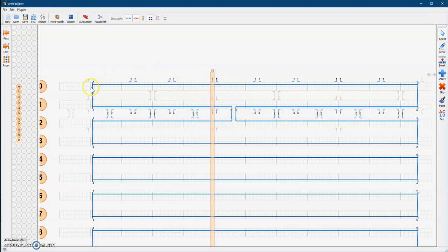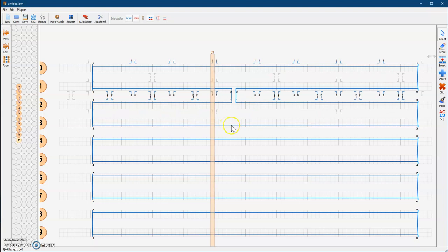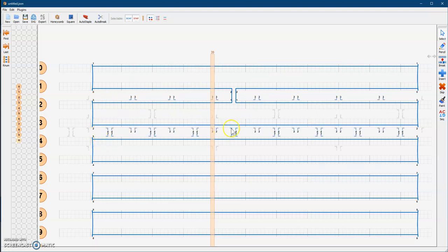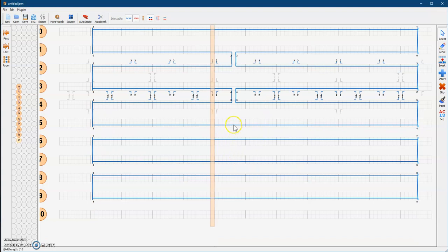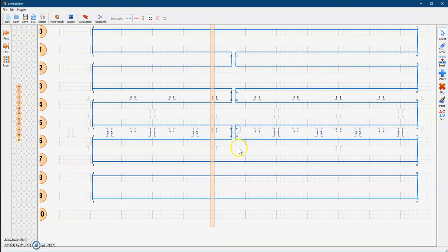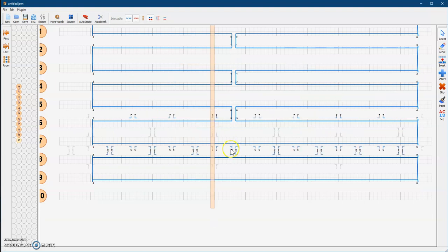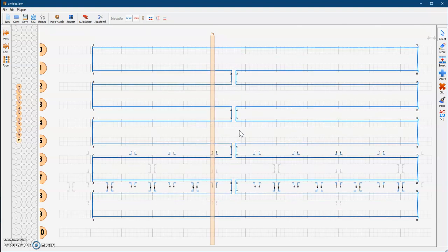Now there's a continuous loop between these four from 0 to 3 — it goes here, follow along the track, and it's a closed loop. Let's continue this closed loop down. Now we come over to where we had the 3 or 4 position. Now we have all six of them in one continuous loop, and we're going to continue this. This is the same technique you want to use for every single shape that you make. As the shape gets more complicated, you get more elaborate. And that's it — that's your simple square.